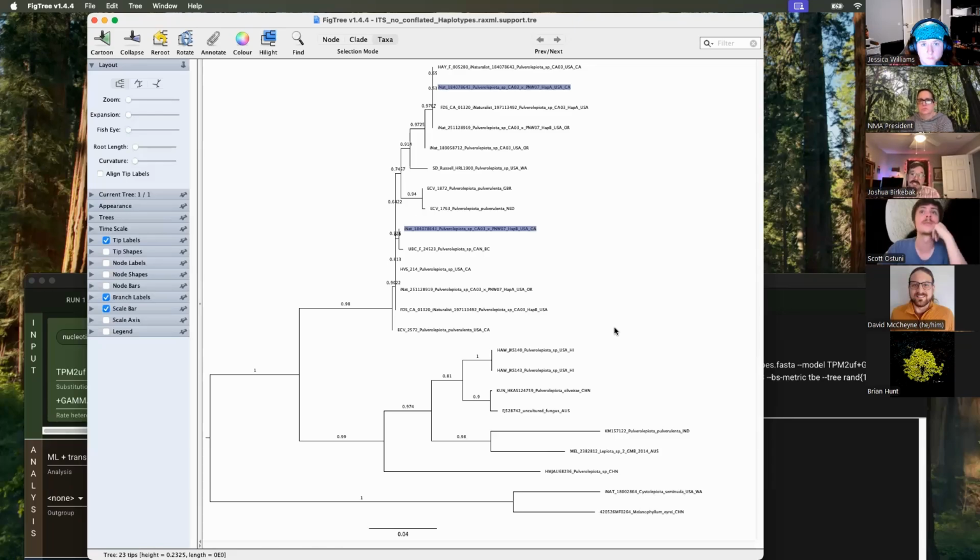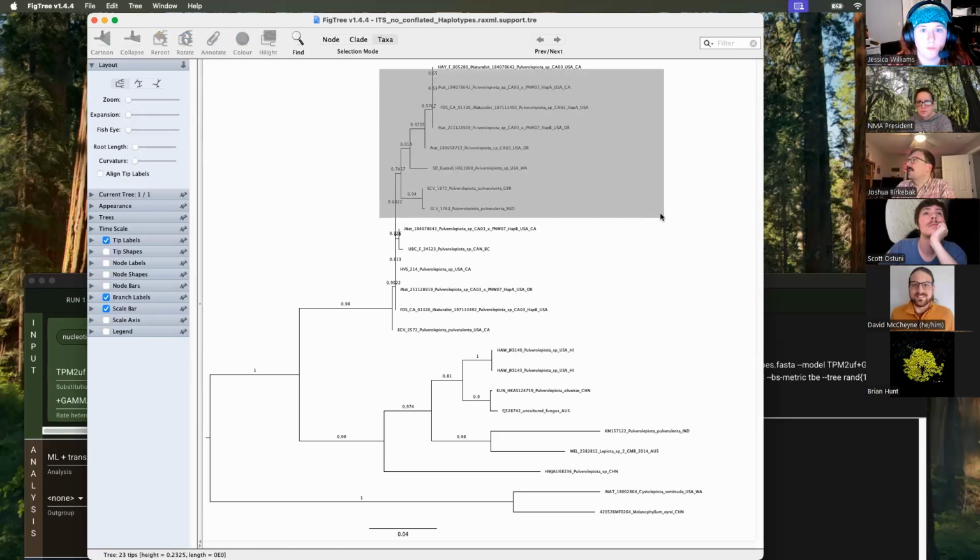It's more common to see something with both sequence variants than it is to see something that only has one, right? Yeah. I want to go back and make a better tree for those Entolomas I was looking at, because we have more of those that are just one or the other. On this one we actually don't have a clean read of PNW07. Is that this one? I should have named them differently.